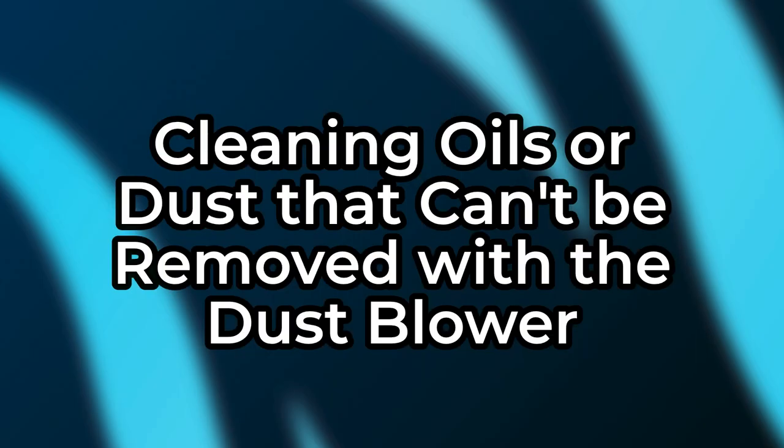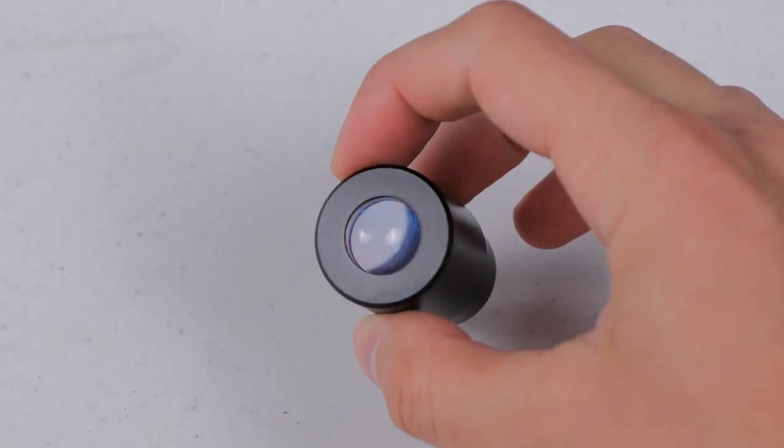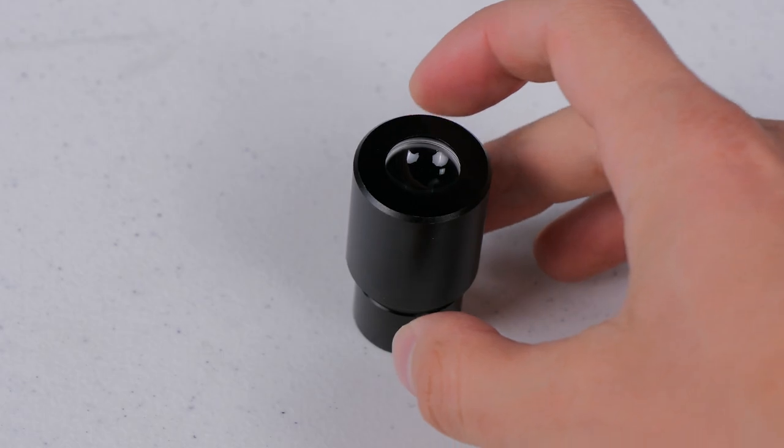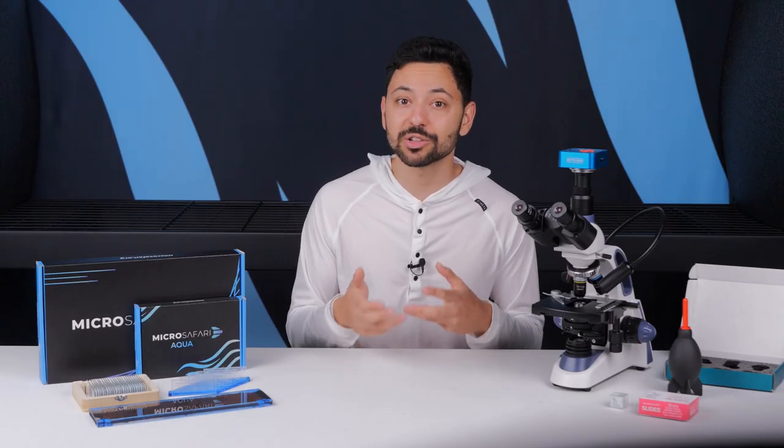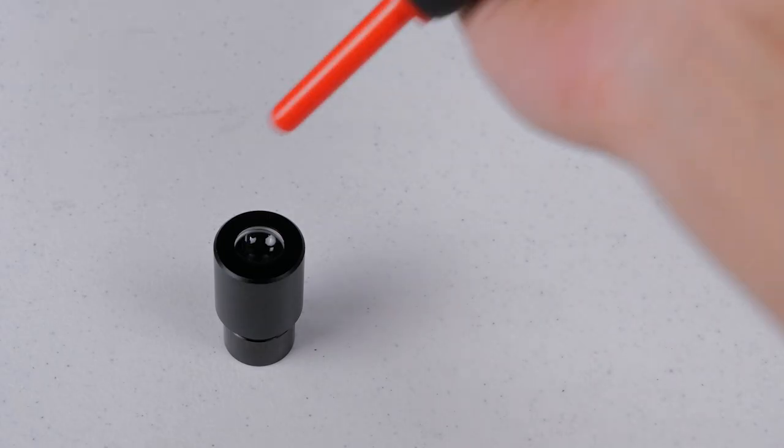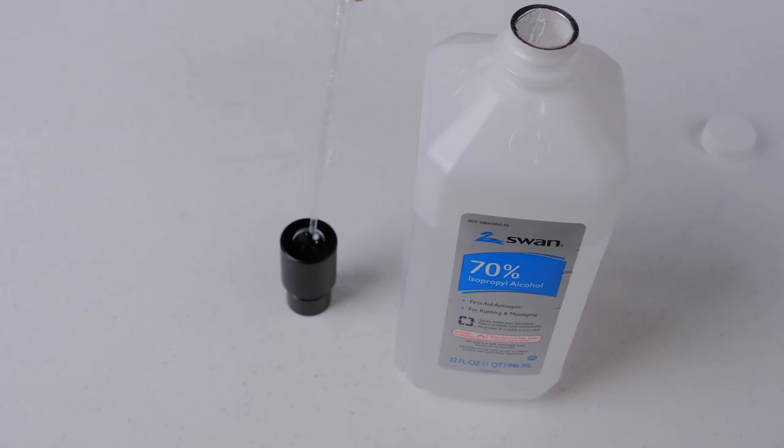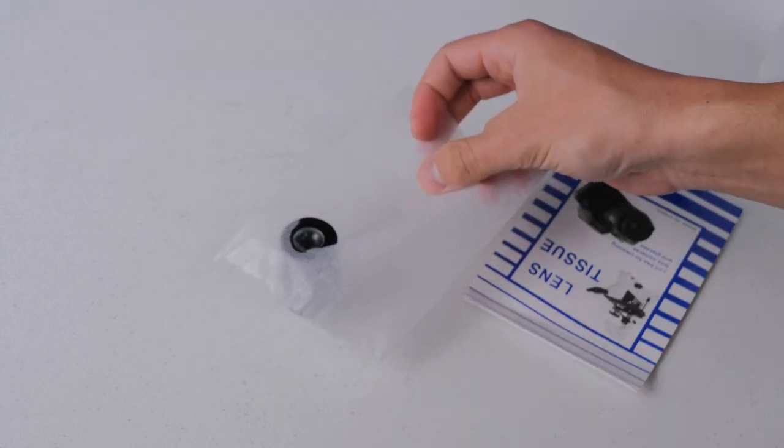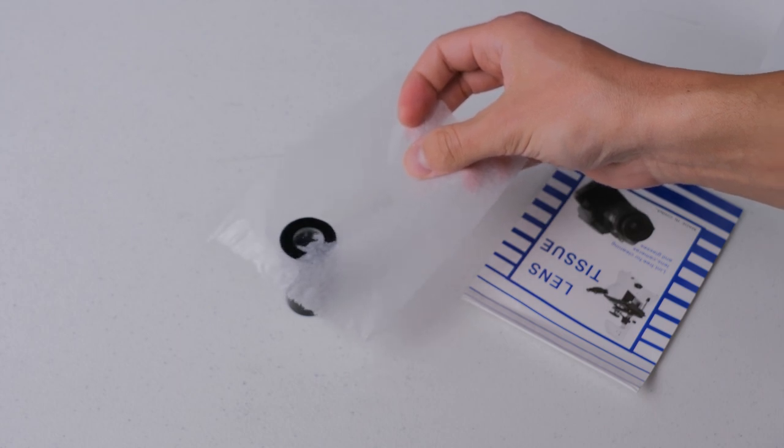Cleaning oils or dust that can't be removed with the dust blower. It's inevitable that if you use the eyepieces enough your eyelashes will touch the lenses and contaminate them with oils that will cause dust particles to stick to the glass stronger than what you can blow off with the hand dust blower. Start by blowing off any loose dust and then drop some regular ol' isopropyl alcohol, aka rubbing alcohol, onto the eyepiece. Using either the included lens paper or just a clean microfiber cloth wick away the majority of the isopropyl alcohol.